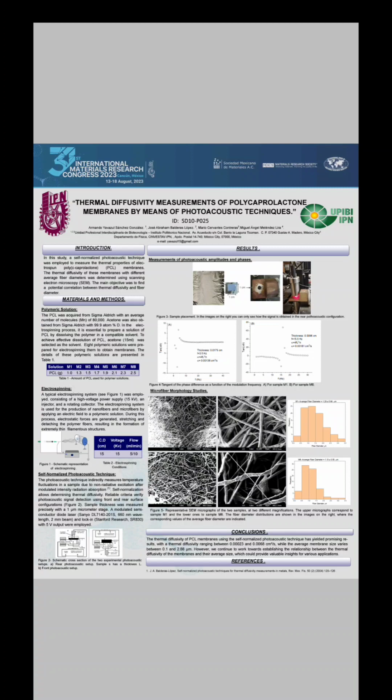I sincerely thank you for devoting your time to reviewing my poster related to my research topic entitled Thermal Diffusivity Measurements of Polycaprolactone Membranes by means of Photoacoustic Techniques. I am Yavasul Sanchez from the National Polytechnic Institute of the Interdisciplinary Professional Unit of Biotechnology. Let us commence.